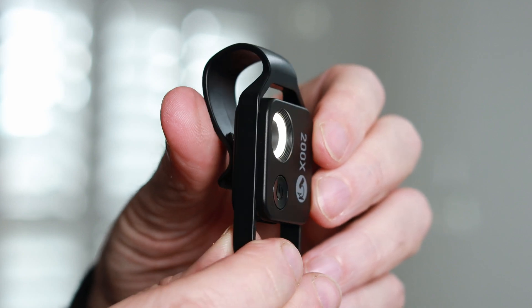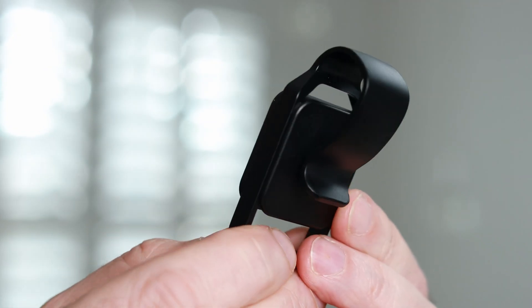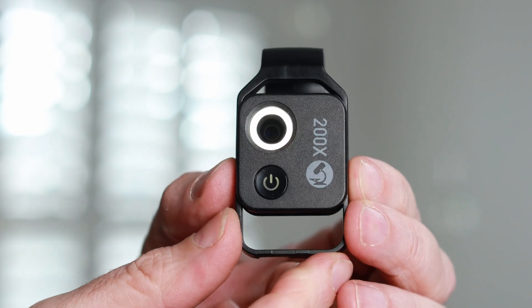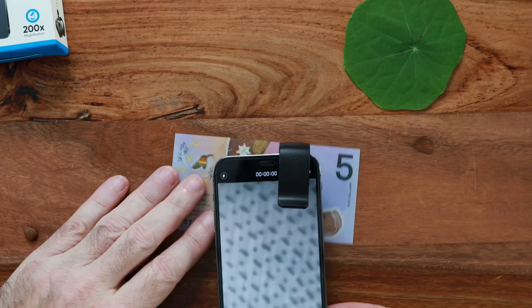In terms of usability, it's really easy to use. It fits on just about any phone — it has a universal clip that you simply slide on top of the phone and align it over the lens. Because it doesn't have a specific fit for any type of phone, there is a little bit of manual adjustment required in order to line up the lens and get it in the correct position. But it doesn't take too long, just keep in mind you will have to fiddle around with it a bit before you start using it.